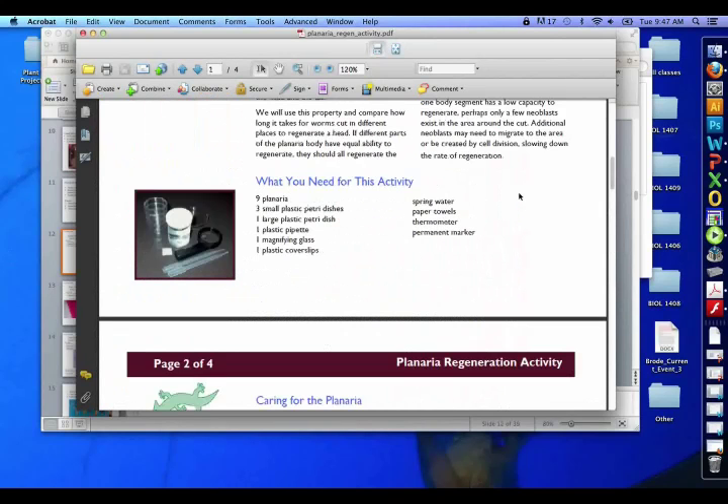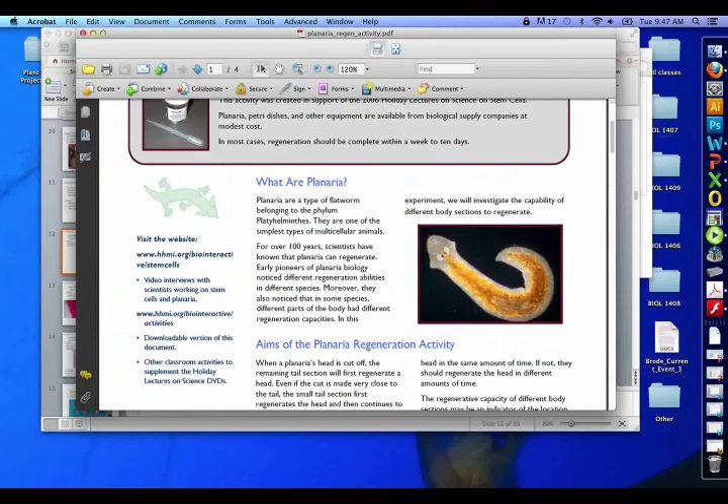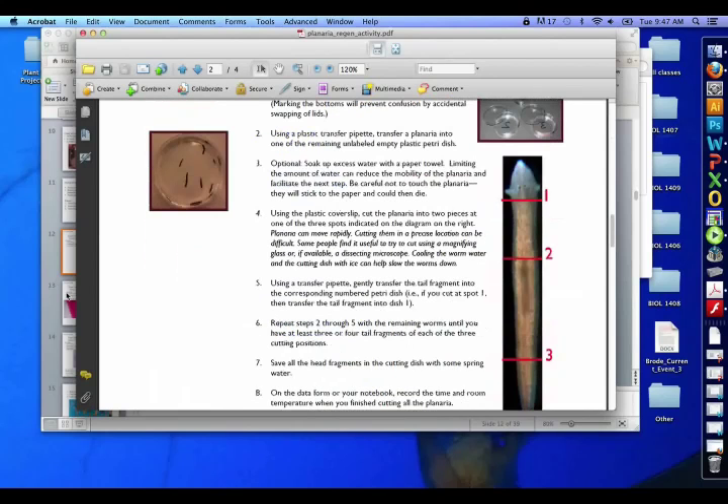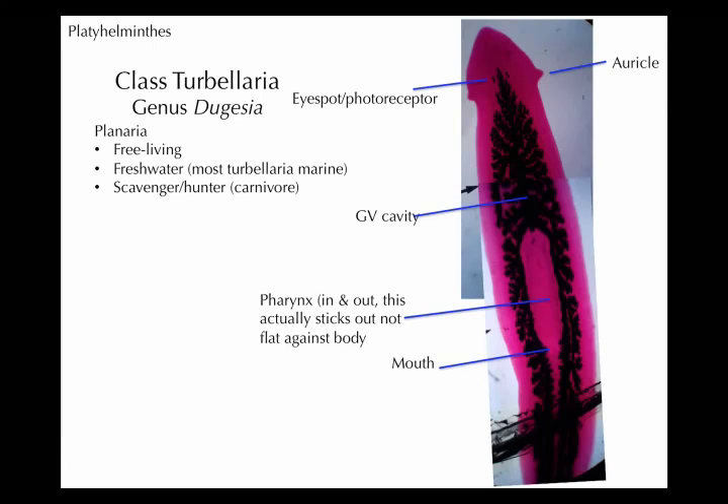You can see the eye spots and photoreceptors here. All this yellow, orange, and light brown — and here it's black — that's all gastrovascular cavity. You can see it's highly branched, which is good for exchange across the surface, because lots of surface area. Remember, this gastrovascular cavity is going to be acting for digestion as well as for circulation, meaning distributing nutrients throughout the body.